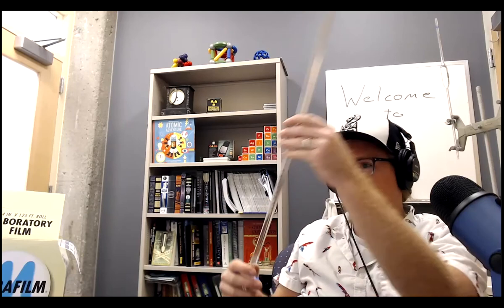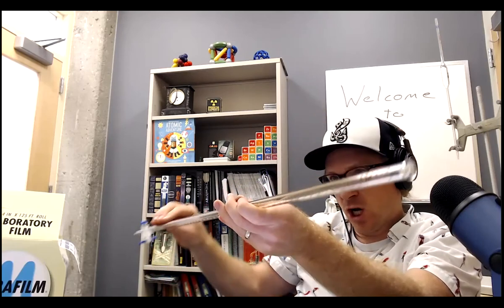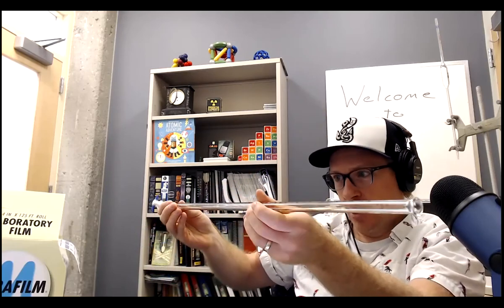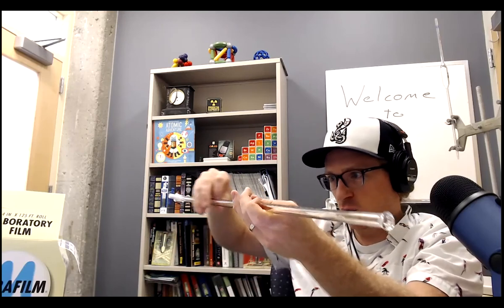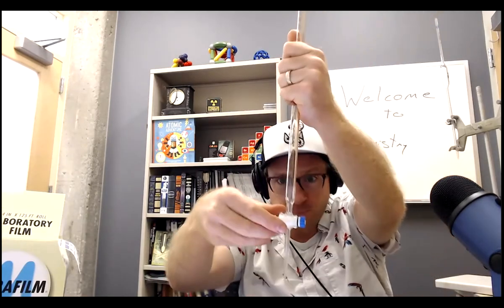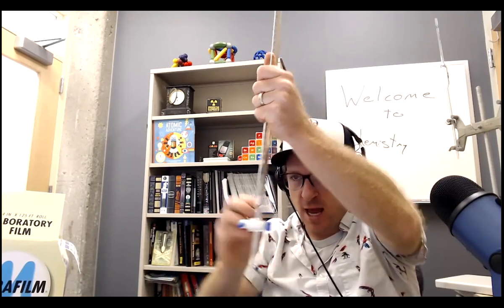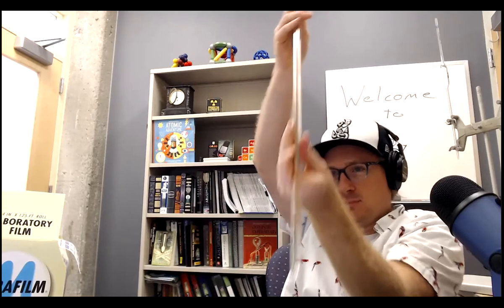You should have one of your biggest beakers as a waste beaker. Put that in the back middle of your bench. You want to rinse this. So leave it closed, turn it on its side, and rotate it, spin it, and coat the whole surface. This does have a color, so you can actually see it when it's coating every single surface. You also want to rinse the tip too. Then turn it back over, rinse the tip, spin the stopcock around, rinse every single surface. Then you can pour the rest out the top into your beaker.